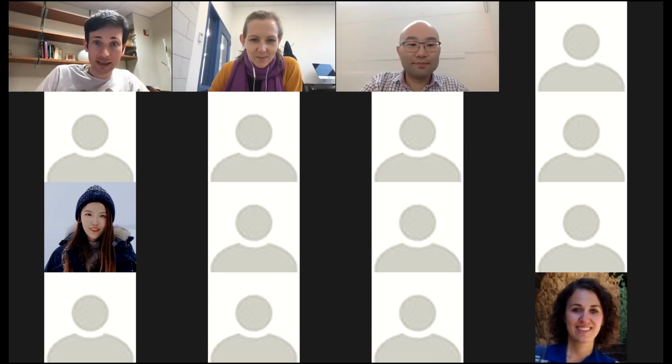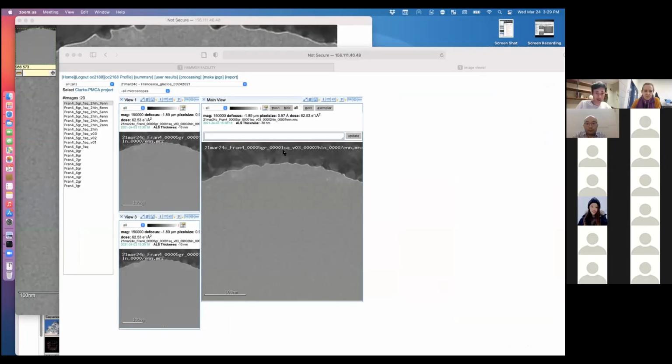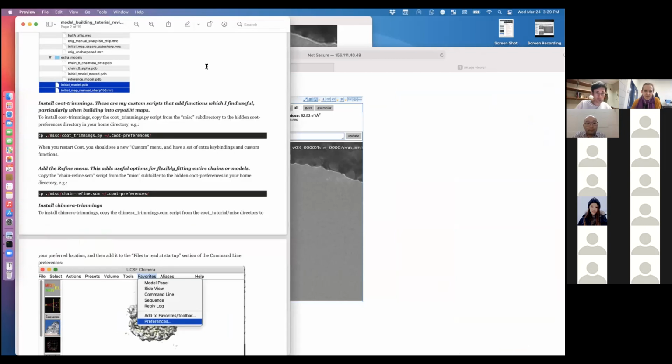I hope everybody's had a look at the PDF we're going to be using. I'm going to share screen in a moment and we can take a look at it together. Since there's a limited group here, we can structure this in whatever way is the most useful to you guys. So please feel free to chime in and to ask questions. That's what this is for, right? Please don't hesitate to speak up.